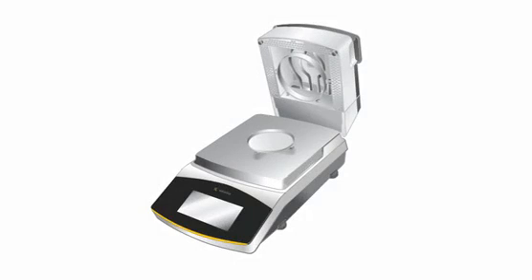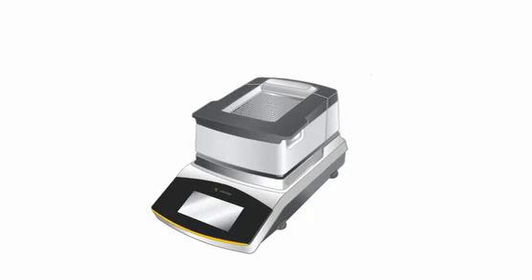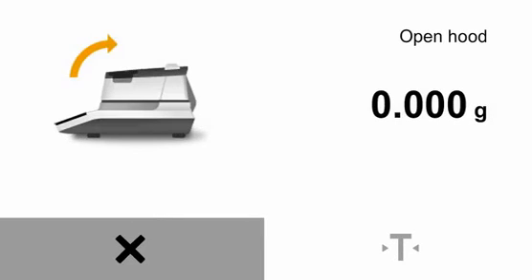Close the hood afterwards. The moisture analyzer MA-160 starts taring automatically. Filling in a sample. Please open the hood.